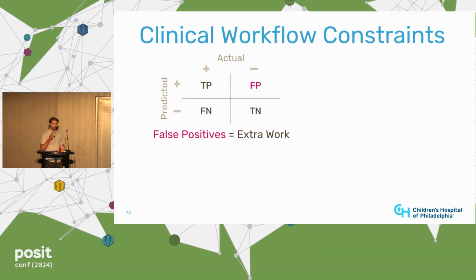They might have to find the ordering provider, call them, get in touch with them somehow and say, hey, did you really order this blood test for John Smith? Because there has been anecdotal evidence in the past where you get a blood result published in the chart and the provider says, I never ordered this. And so one quick way to check for a WBIT is just confirming, hey, did you actually order this for this patient? Again, that's extra work on the backs of the lab staff.